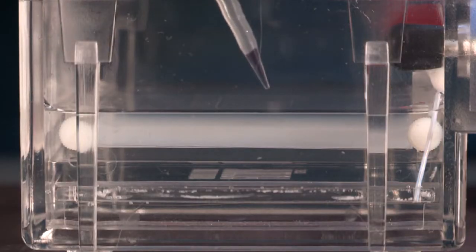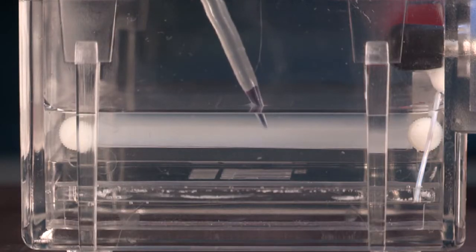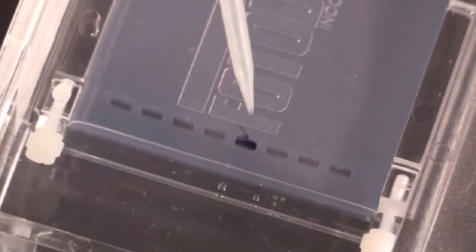Be certain that the tip of the pipette breaks the surface of the buffer, hovering just above the well so as not to fill it with the tip. Gently press down on the plunger, loading your sample into the well.